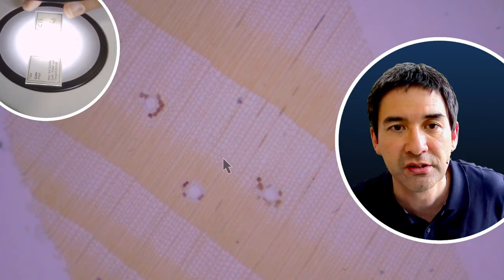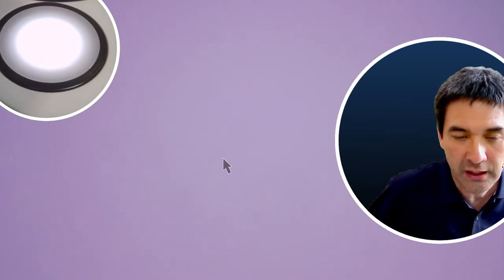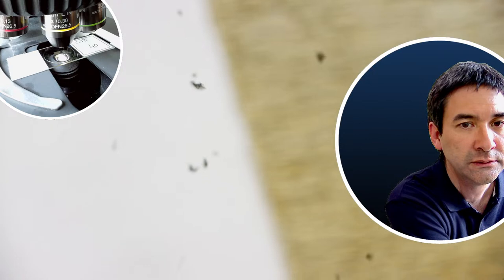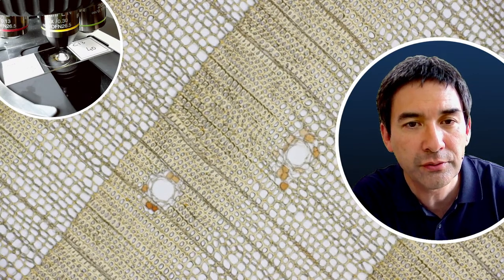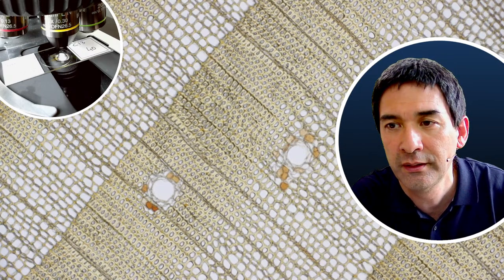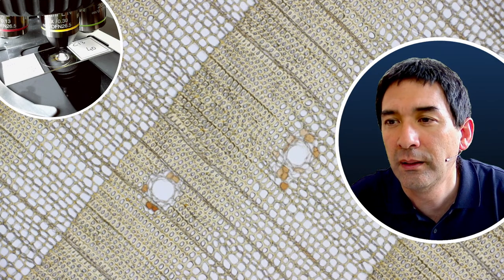Of course you also want to see how this looks under the compound microscope. Let's put it in here and switch over to the microscope view. I have to focus again. This is how it looks under the compound microscope — that is pine wood.